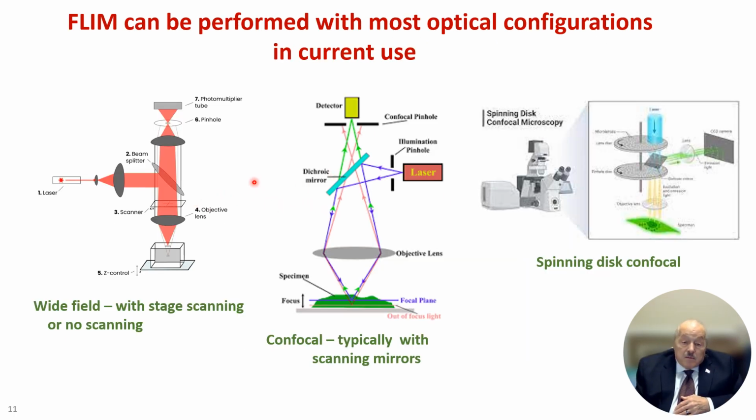And another important thing that was available was confocal detection, because confocal detection helps a lot in improving the resolution of the image. While you can do FLIM without confocal detection, that's less common. And what confocal detection does is it is a method to remove the out of focus emission.